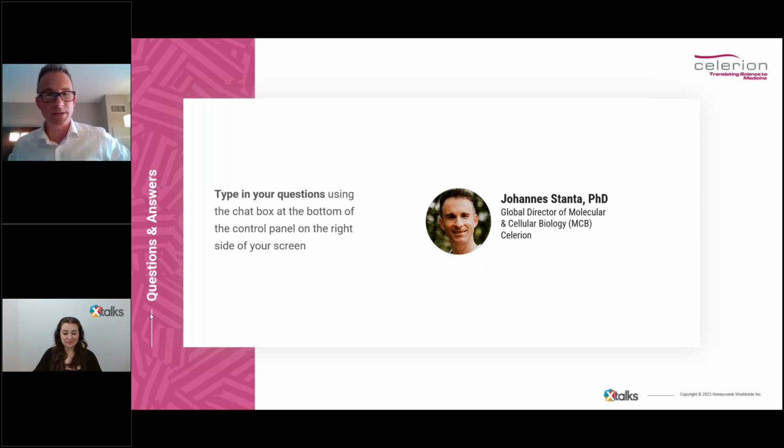Yes, and we thought about this very intensively, and we chose genomic DNA as our standard matrix to be used for various reasons. The main reason, my justification, is that it is the most suitable for running in the qPCR, and it's also relatively easily available and producible and reproducible, and people can understand it and get their head around it. And obviously it will show you selectivity as well immediately, because you have the genomic DNA there, you've got it present, and for me that makes the best surrogate matrix to be used.